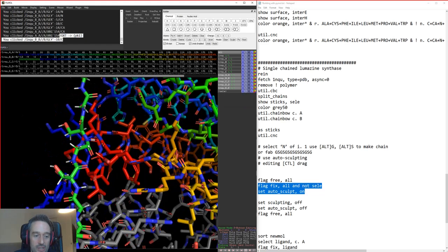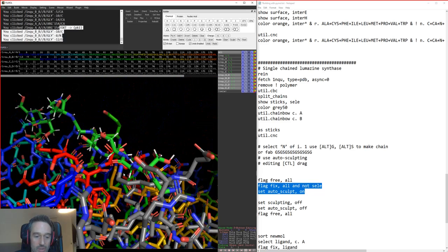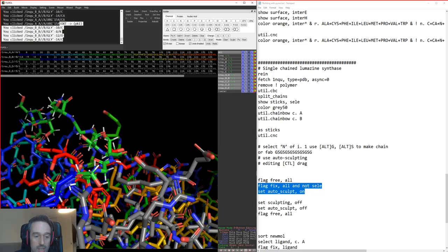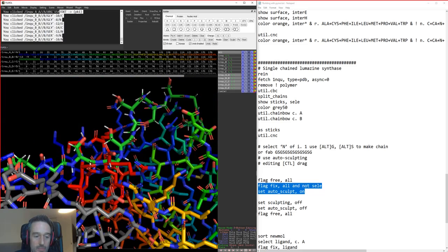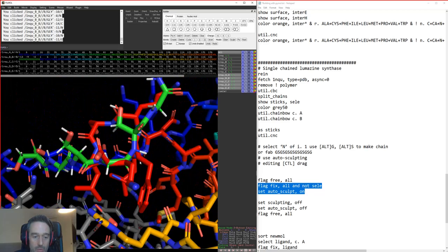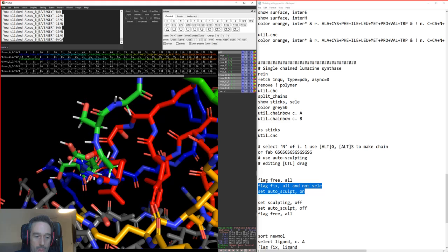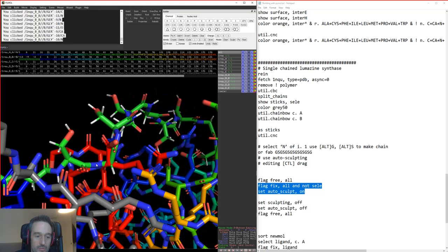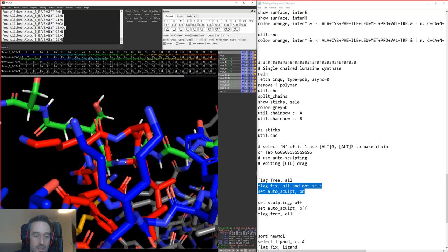And what we can then, I guess, try and do is align our peptide chain to this in such a way that we can overlap our peptide bond here. Oh, that's not working very well actually. There we go, that's kind of close. I mean, obviously, if you're doing this yourself, you can pay a bit more attention to making this work.